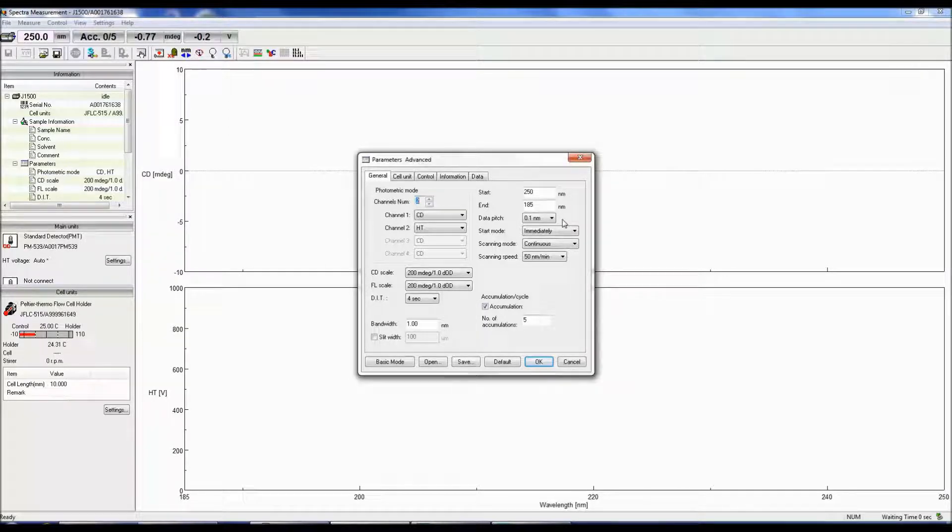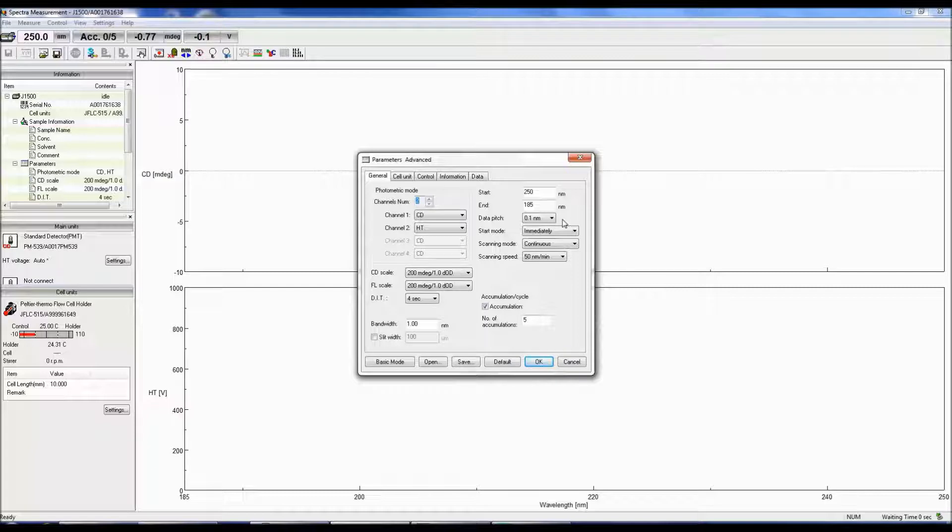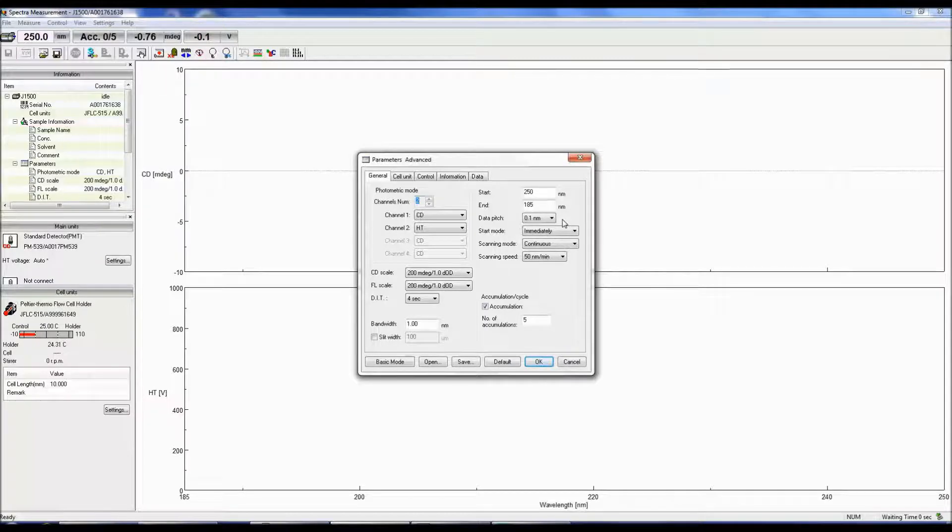The data pitch determines the number of data points collected at the specified interval. 0.1 nanometers is a good interval to start with and should provide a spectrum with an optimal signal to noise ratio.